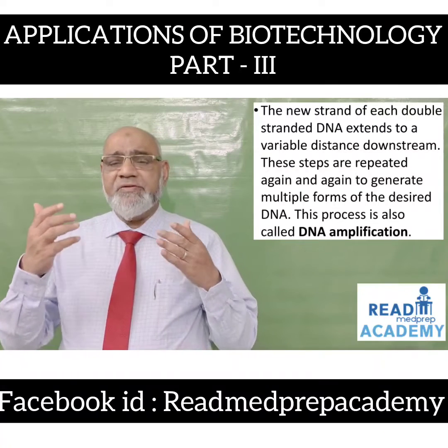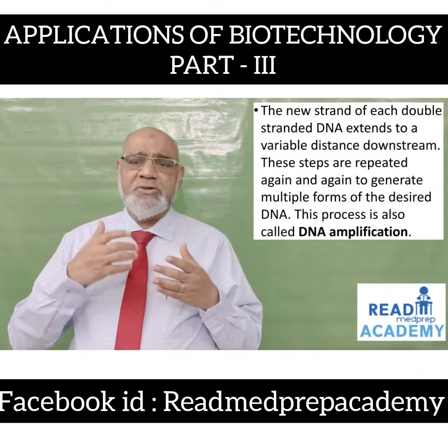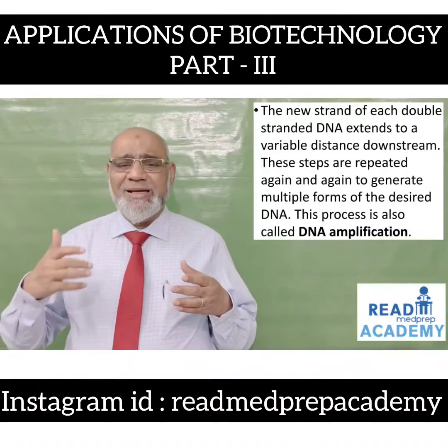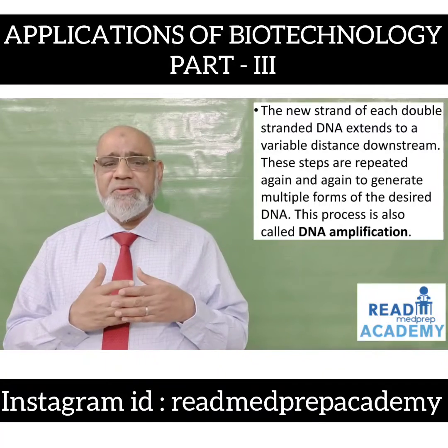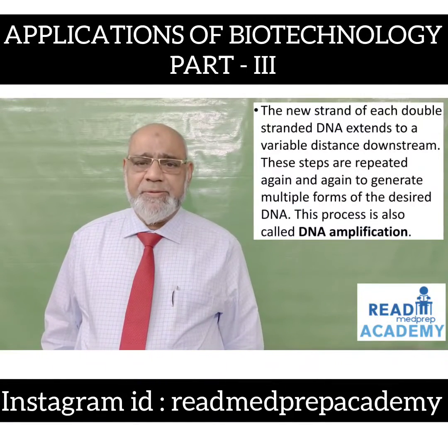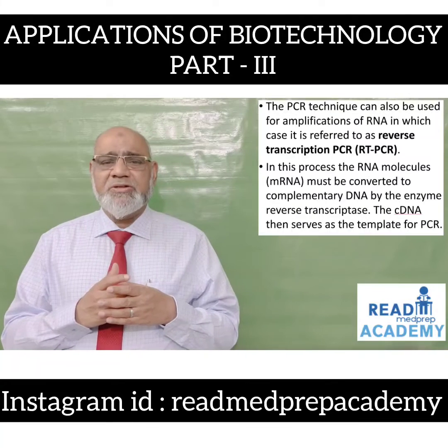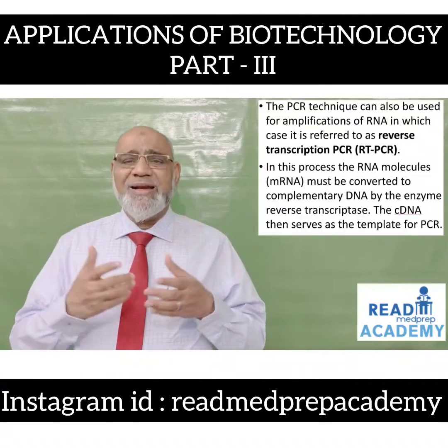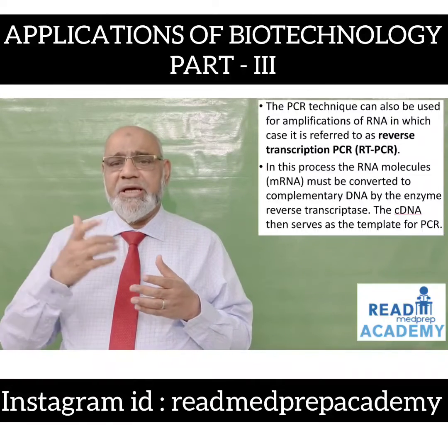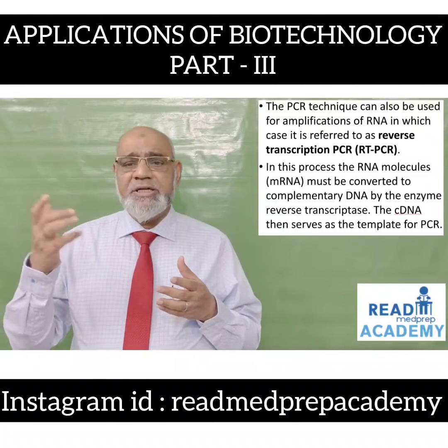The new strand of each double-stranded DNA extends to a variable distance downstream. These steps are repeated again and again to generate multiple forms of the desired DNA. This process is also called DNA amplification. The PCR technique can also be used for amplification of RNA, in which case it is referred to as reverse transcription PCR, otherwise shortly called RT-PCR.